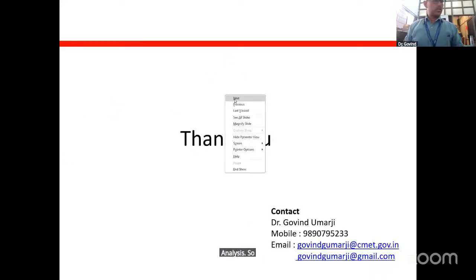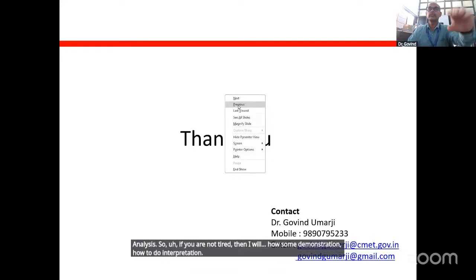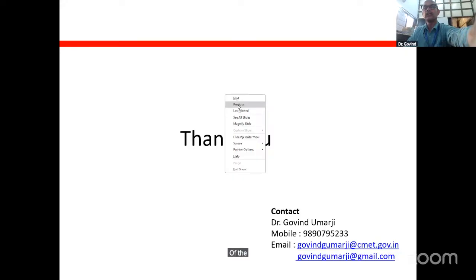So if you are not tired, then I will give a demonstration of how to do interpretation of the sample using the software. Okay.